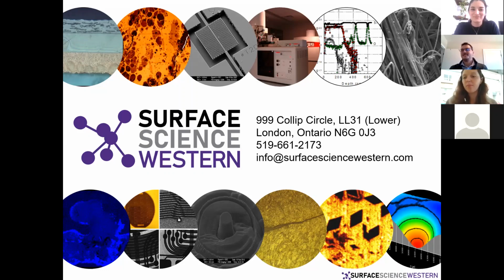I have one question. I know that it's outside the topic, but I have two questions. Can you comment on the preparation of the sample, the problem of pollution first, and after, just a few tips that you can give us to have a very good in-depth analysis when you have etching? What's your experience on that?